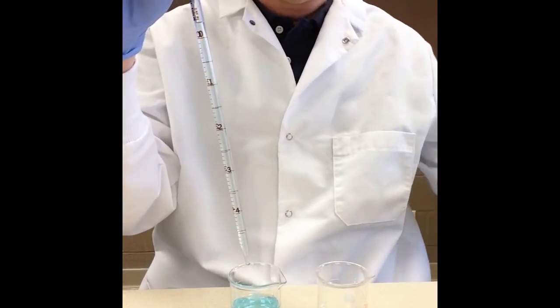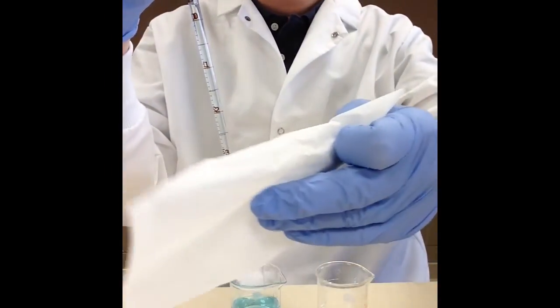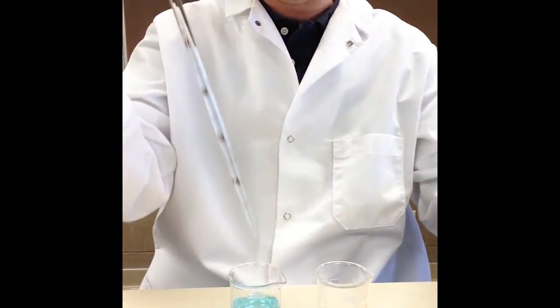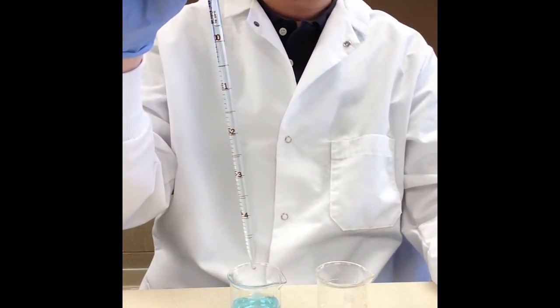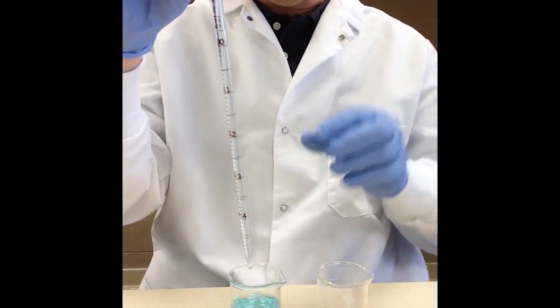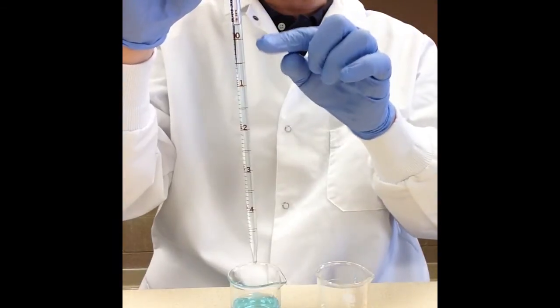So I've gone ahead and I've taken it out. Now what I need to do is I'm going to take a kim wipe and in a downward motion I'm going to wipe off the excess liquid around the outside of the pipette.